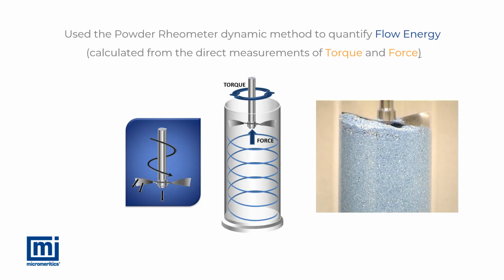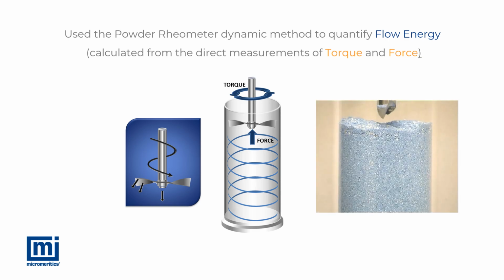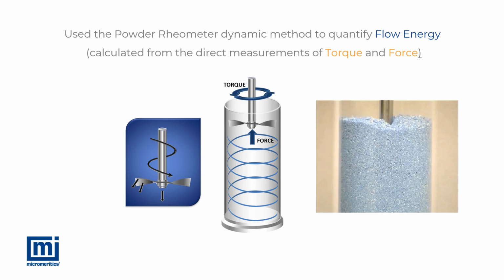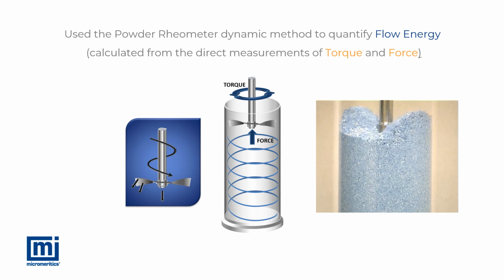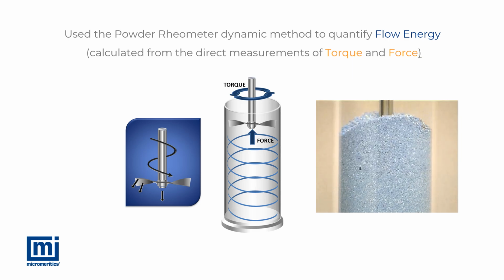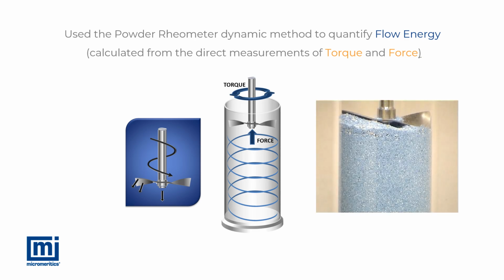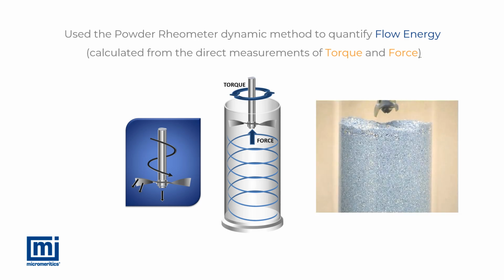In order to establish the flowability of the granules produced, the flow energy of each powder was determined by powder rheology, with the force and torque incident on a blade passing through the powder being used to determine the powder's resistance to flow. High values of flow energy correspond to a powder which is more resistant to confined flow. However, it should be noted that high or low flow energy should not be assumed to be good or bad. The specific process involved may require one or the other condition. For the purposes of this study, the flow energy is simply intended as a predictor of final tablet quality, and the relative flowability in a particular element of the process is not under investigation.